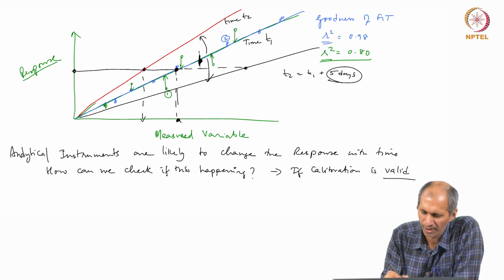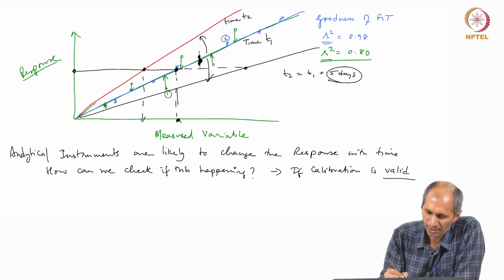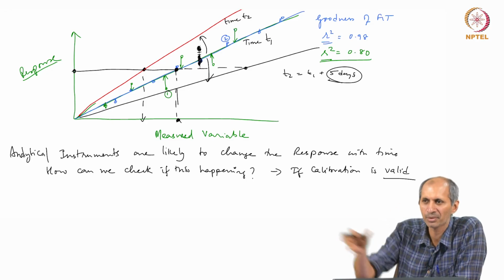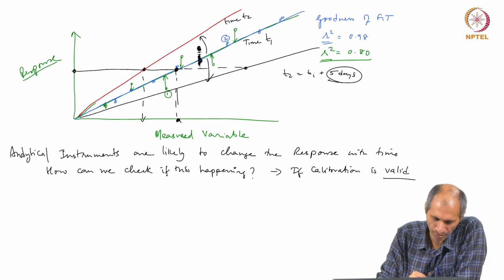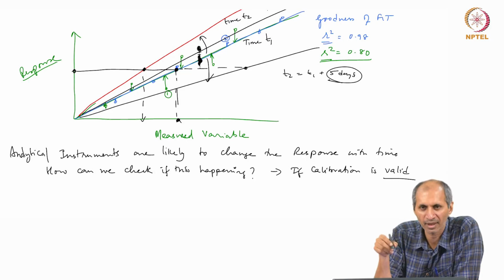So, I am okay with it going up and down a little bit, but you decide when it is not acceptable anymore. On day 1 I measure this, day 2 I measure this, and so on, and I reach a point where it is no longer acceptable. This could mean that the calibration has shifted significantly. At that point I stop and redo my entire calibration and get a new calibration curve, which may look like this, and I follow it until my standards satisfy that.